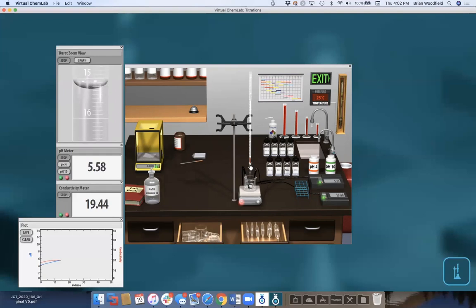Obviously this preset built everything, but you don't have to do that. Different experiments do different lab activities, and we preset the lab differently based on what we're trying to teach. So there's the titration, the endpoint.